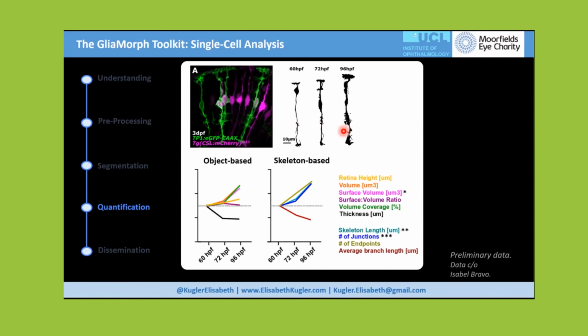And this is all really very reassuring, because now we can obviously look at a whole field of view, analysing stable transgenics, for example, but we can also take this approach to analyse individual cells and track their individual development. And all of this is really exciting, but still a work in progress.